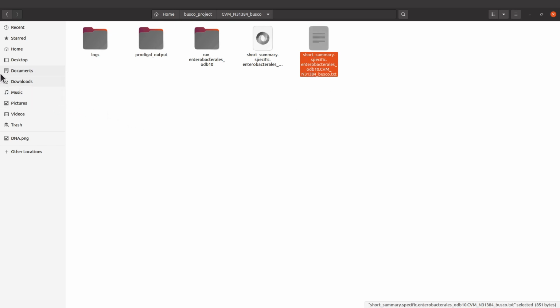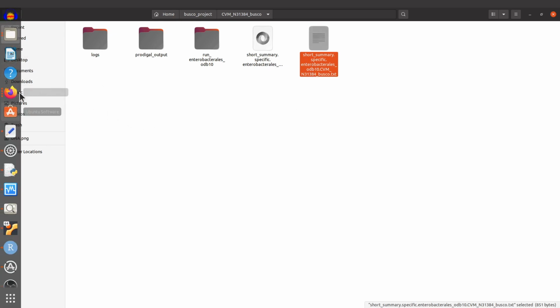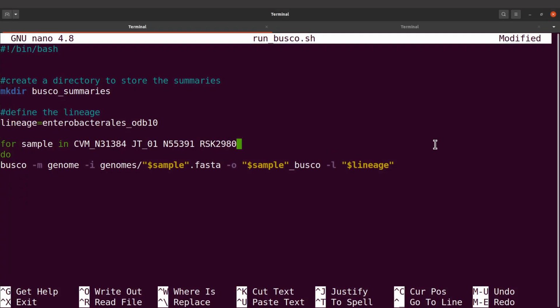And that is the next command we will indicate. So that one will be here.